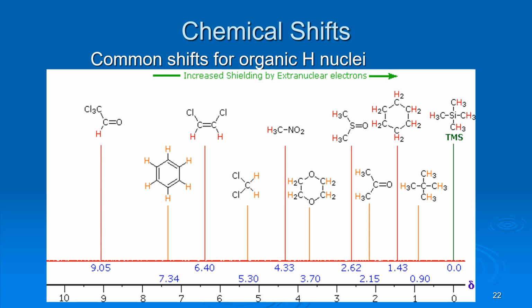Now look here, we've included a C double bond O. Notice that the C double bond O isn't on the carbon that has the hydrogen yet. So it's like a neighbor that is very electron withdrawing. So these hydrogens, if they're near a carbonyl group, tend to be a little higher because that means they're more deshielded. The electronegativity pulls electron density away.